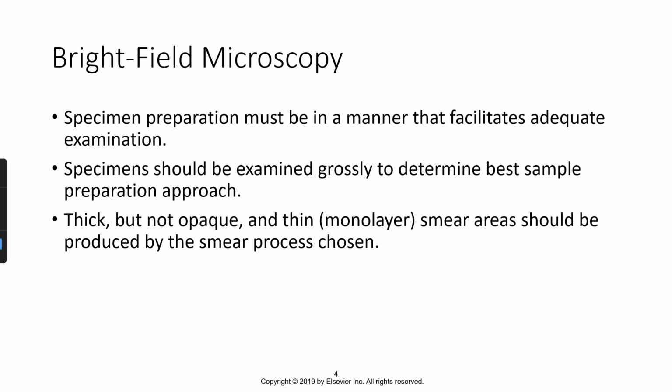We also have to consider, where is the infection going to be? So if we get a chunk of tissue, as I mentioned previously, there may be some parts of the tissue that look more healthy. There may be some parts that look really nasty and grody and black. And we want to be able to get representatives from the different areas within the sample. And the areas that are going to be more likely to be infected, we want to be able to look at those under the microscope.